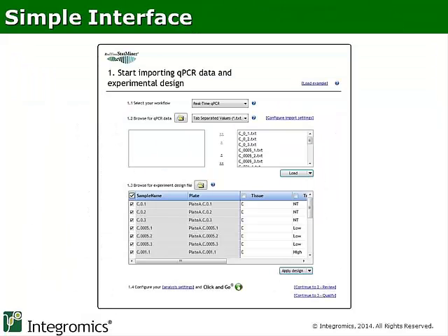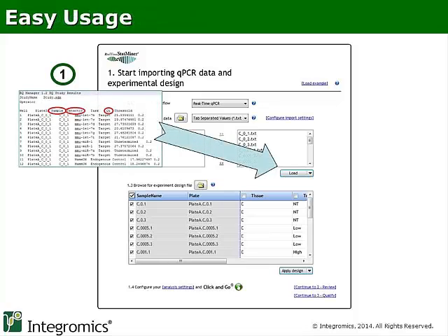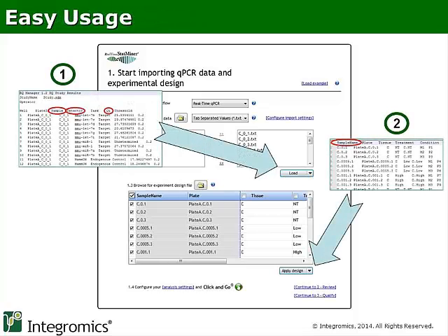StatMiner provides a simple interface. As we can see here, we just need to provide StatMiner with expression values and an experimental design indicating which groups of samples need to be compared. After this, the complete analysis can be executed with a single click.